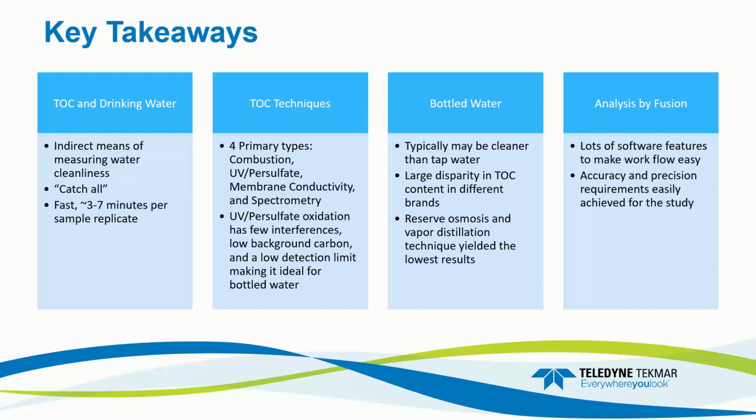They all have benefits and upsides, but the UV persulfate, compared to others for drinking water analysis, has fewer interferences, lower background of carbon, and a lower detection limit, making it ideal to test bottled water, drinking water, and ultra pure water that is needed in our lives today.